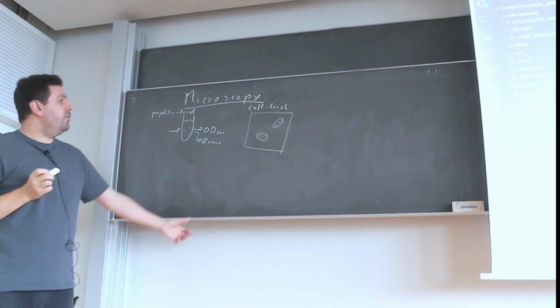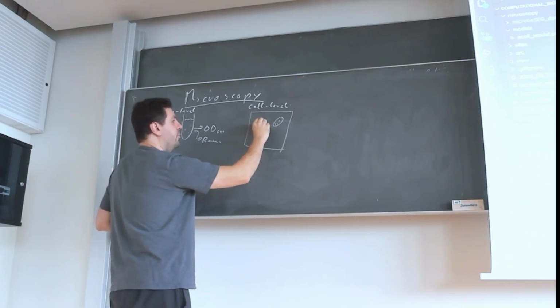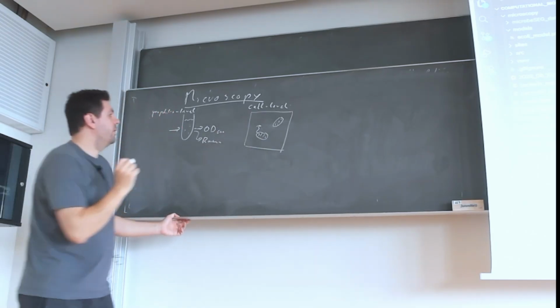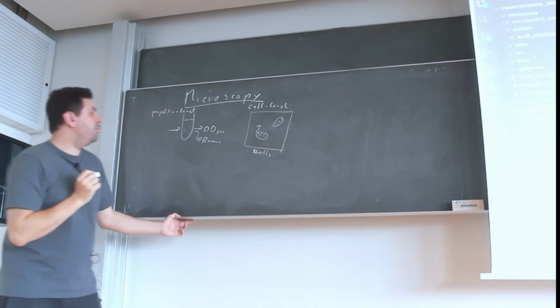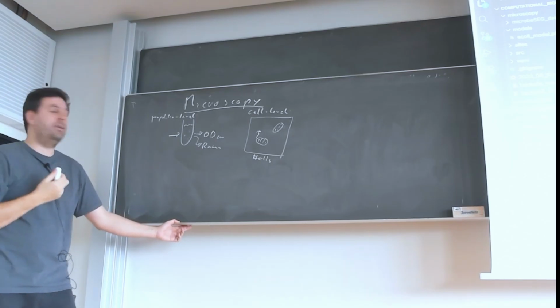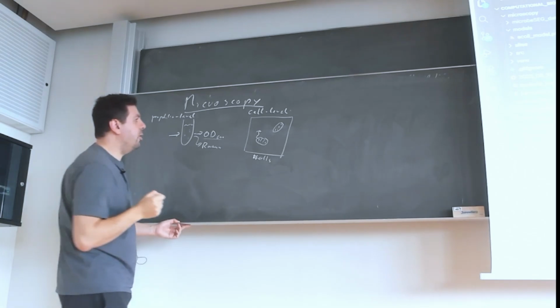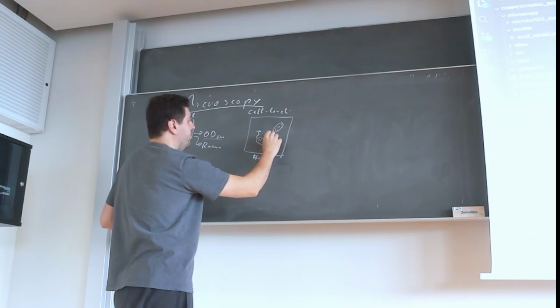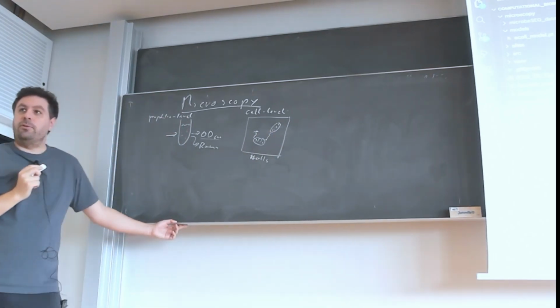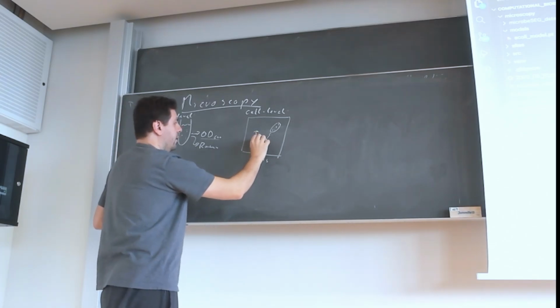And the things you might be interested in is how are they going to move? For example, what is the movement of this? Or you might want to say, how many cells are in my picture? This is a very precise count because it's really a small natural number, compared to, for example, the rough OD measurements here. Or you could be interested even in interactions. This one could interact with this one, for example, by bacterial conjugation. Or you could be interested in duplication rates, for example, this duplicating and being suddenly 2 cells.